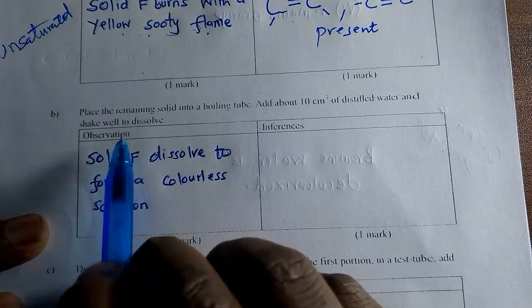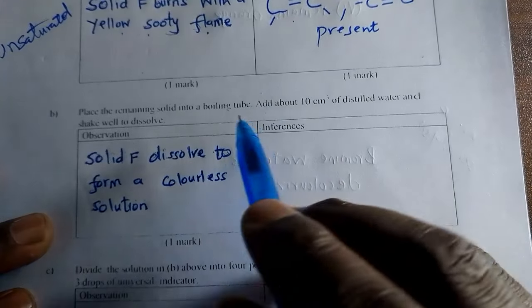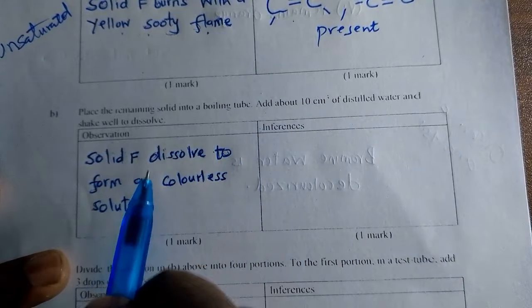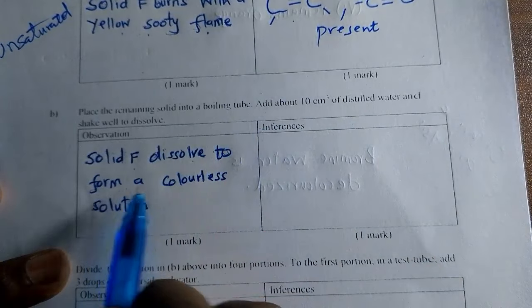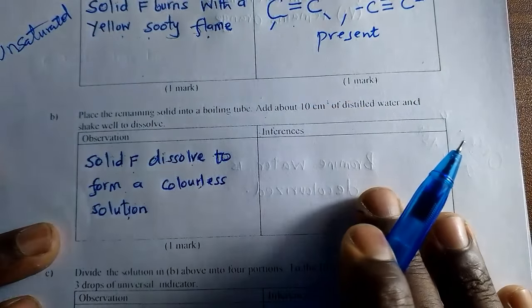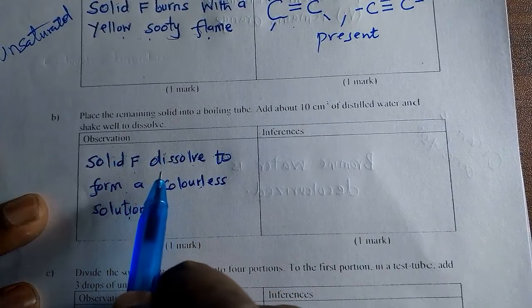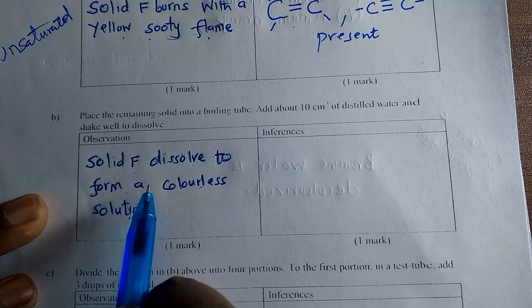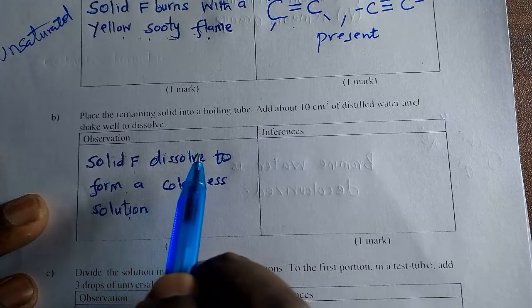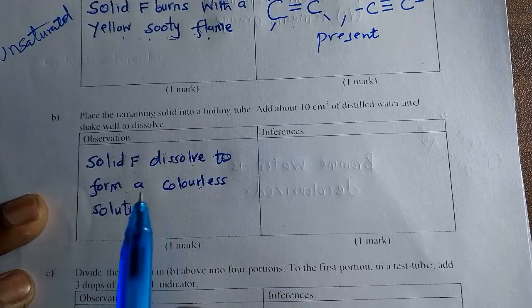Now we are putting the remaining solid in a boiling tube, adding distilled water. Solid F dissolved to form a colorless solution. Because we are dealing with organic analysis, it means this solid is polar. In organic chemistry, a substance which dissolves in water and is an organic compound means that compound is polar.